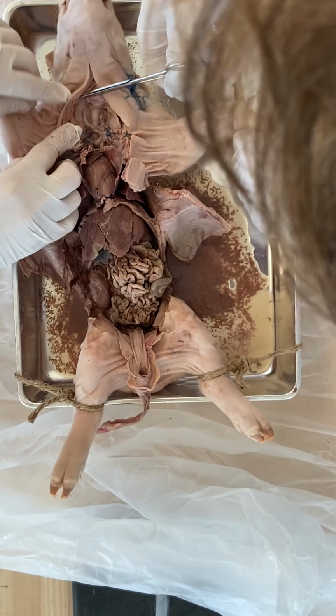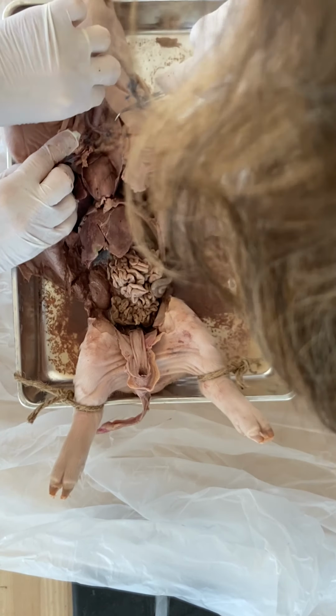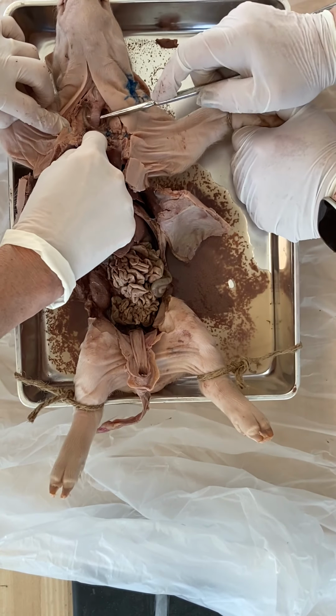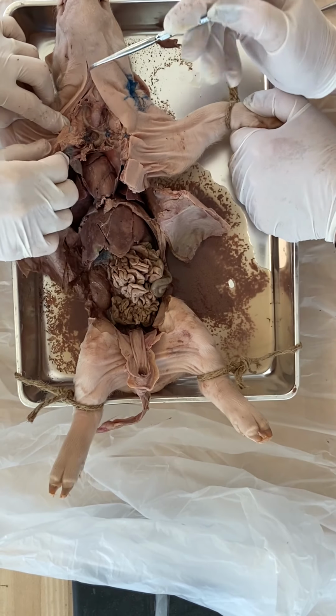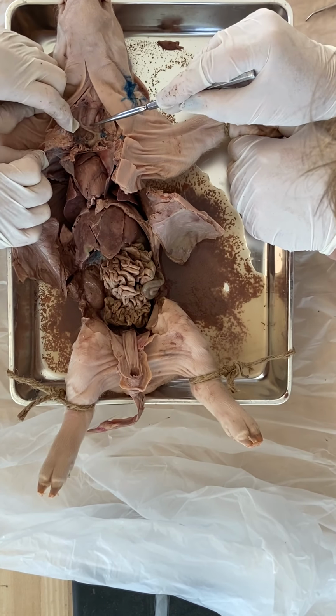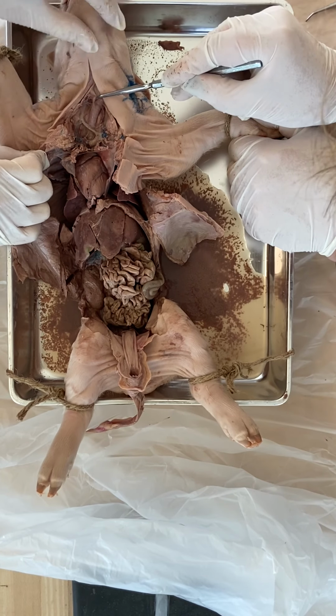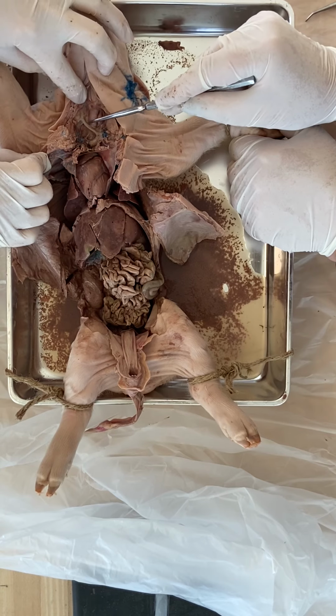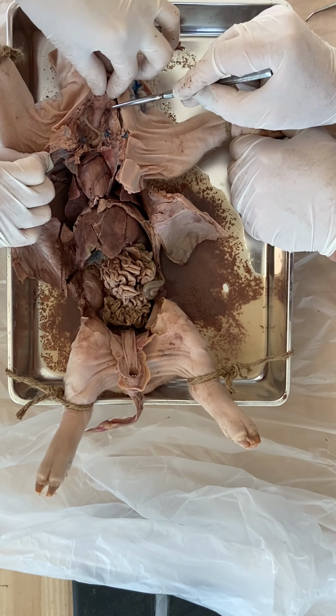All right, so here is the trachea. Let's see if we can get some of these membranes out of the way so that you can see it. Oh, here we go. And the trachea, it's right about here that it's branching and going into the lungs, but you do have all your big blood vessels coming in here too. So you can see the ridges on it. You can see the cartilage rings pretty clearly. You may need to zoom in on your video.